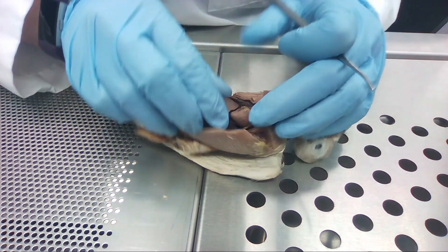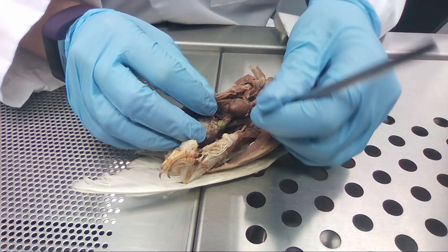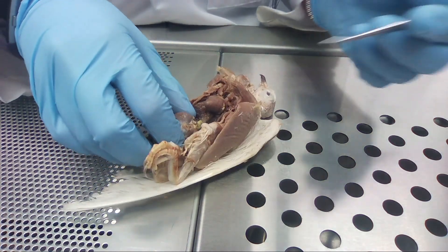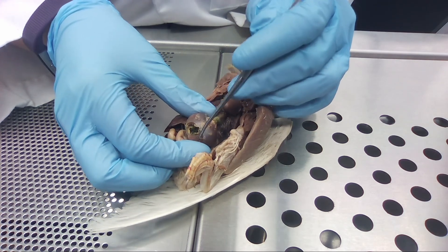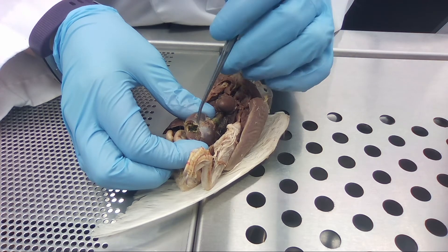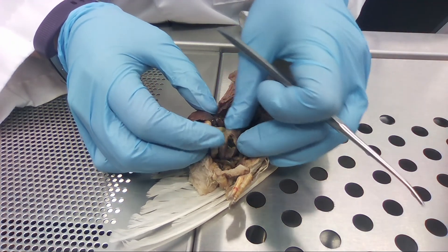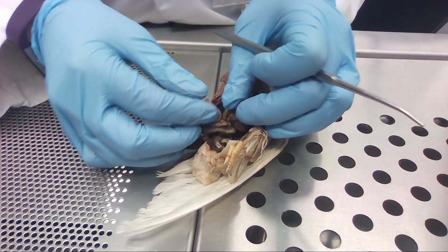This would continue down into the abdominal cavity where we get to the proventriculus, which is this green part right here — this is where all of the gastric enzymes are. This leads to the gizzard, which is a super muscular organ. As you can see we cut it open and it's all muscle, and this is where the grinding and crunching of all the seeds occur, so it has to be really thick. Then it leads into the small intestine like any normal animal.